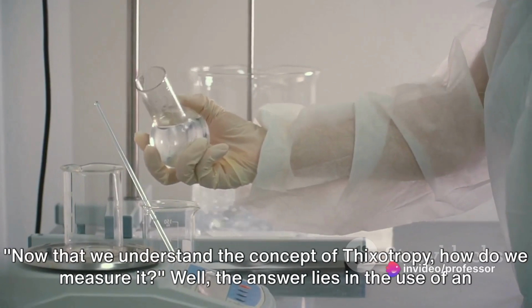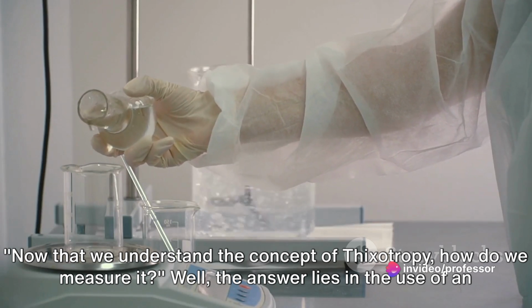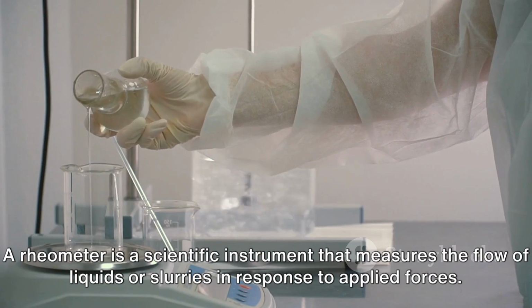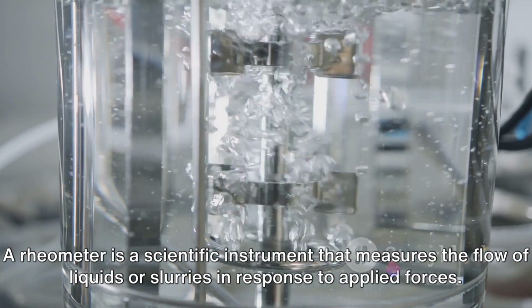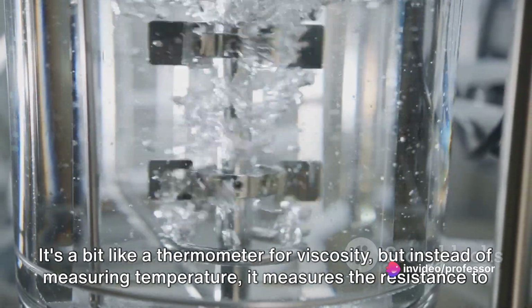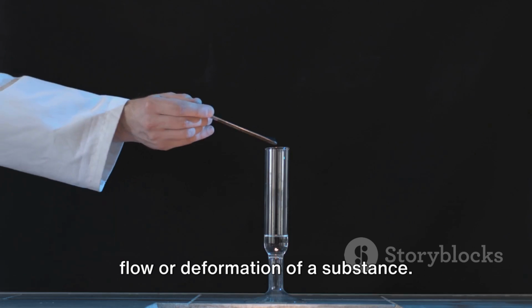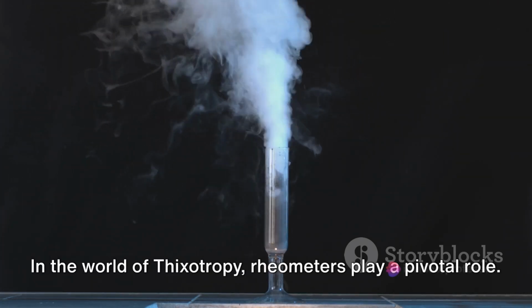Now that we understand the concept of thixotropy, how do we measure it? Well, the answer lies in the use of an ingenious device known as a rheometer. A rheometer is a scientific instrument that measures the flow of liquids or slurries in response to applied forces. It's a bit like a thermometer for viscosity, but instead of measuring temperature, it measures the resistance to flow or deformation of a substance. In the world of thixotropy, rheometers play a pivotal role.